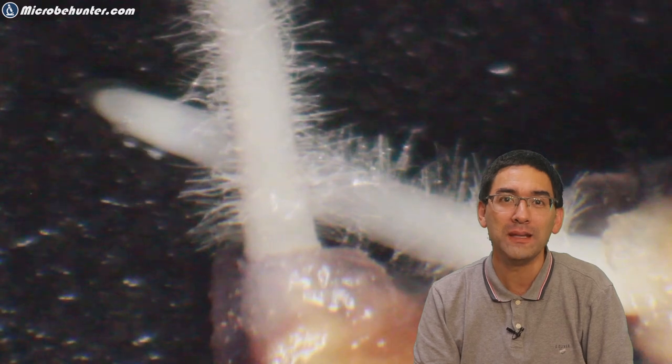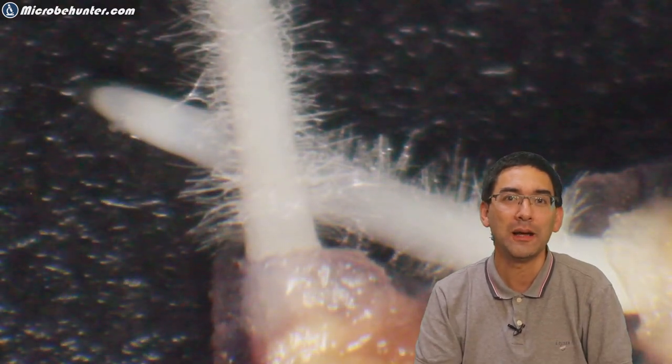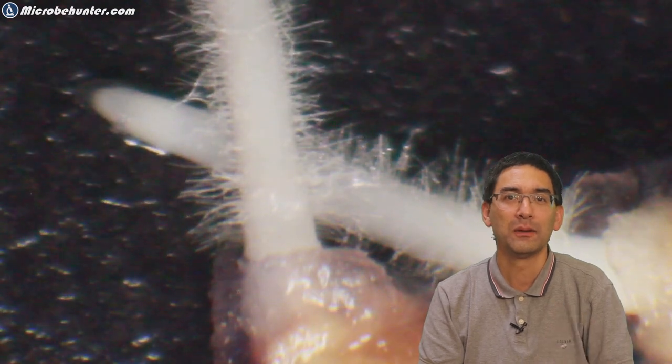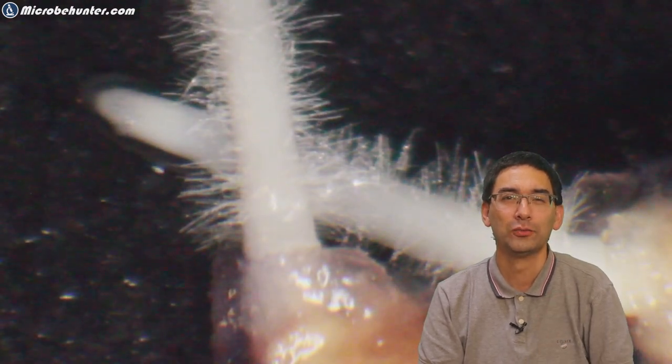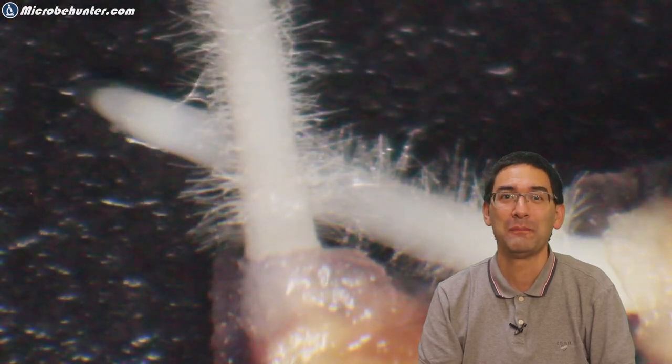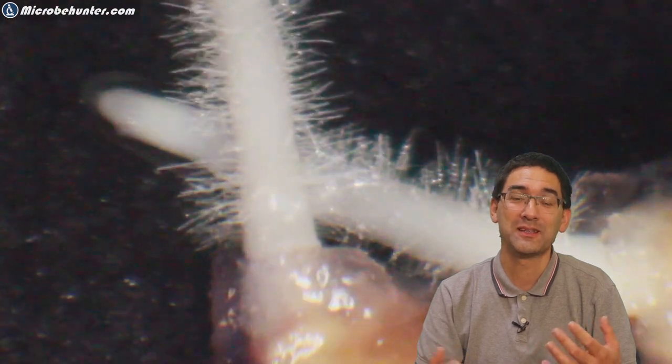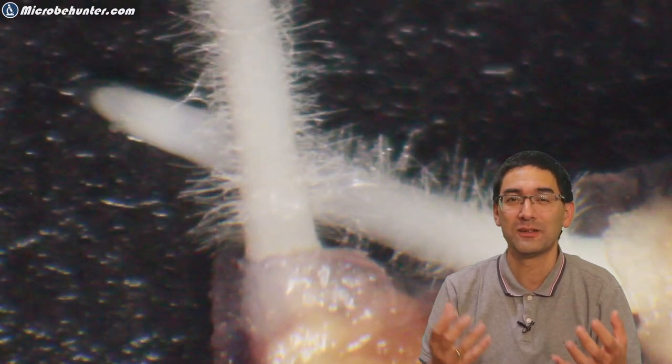This is the growth of the root in 25 minutes. The water also evaporates a little bit in the meantime, but it's still quite visible if you look very carefully at the root. In 25 minutes there is something happening there. I consider this always kind of fascinating to actually make such slow movements and slow growth visible under the microscope.